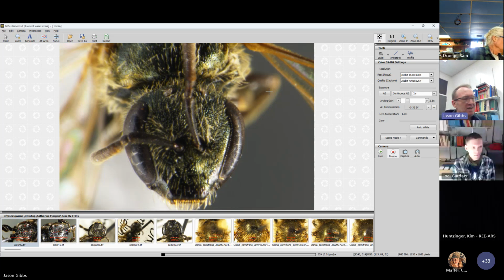So this is much more triangular, the clypeus protrudes well below that line at the base of the complex. Otherwise relatively similar in terms of puncture density and coloration. This will have a normal mandible, a normal trochanter, so you can recognize it from callidum that way. But this face is even more stretched out in the clypeus than versatum's.